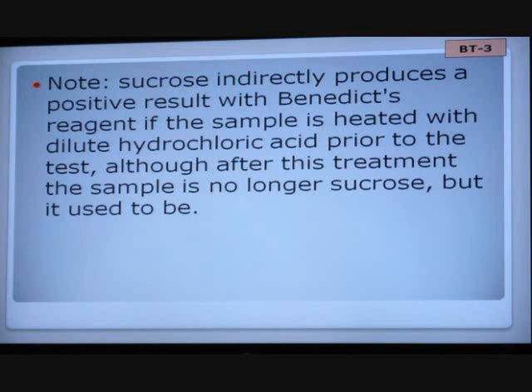But you don't know how much. Say that again. Green is what? Okay, if you get a green color, that's your weakest color. That means you got a little sugar, not bragging rights. If you get an orangish yellow or a brownish yellow looking color, that means you got more than you had in the other sample. And if it turns a real pretty red, or like a brick red, not fire engine red, a brick red, then that sucker is full of sugar.